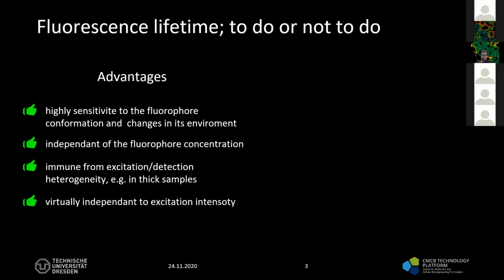Any changes in the ion concentration, temperature, or pH in the microenvironment, inside your cell culture, or around the tissue, or inside an animal model, would affect the decision of whether the electron decays through fluorescence or the other ways. And that changes the decay behavior of the fluorophore. It's a very sensitive tool to address changes in the conformation of the fluorophore, the proteins or enzymes that we are studying, with changes related to the environment or any changes inside the cell.